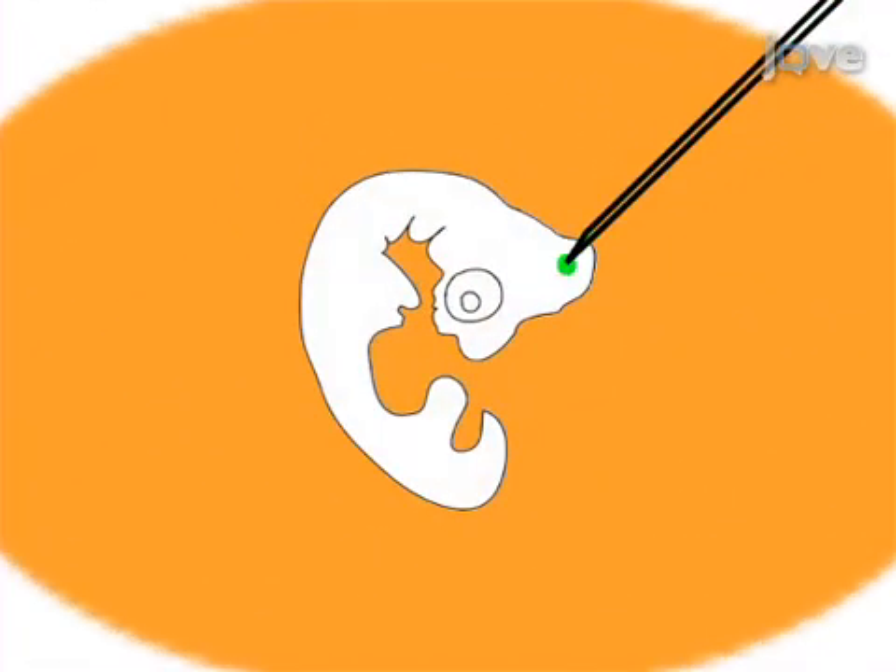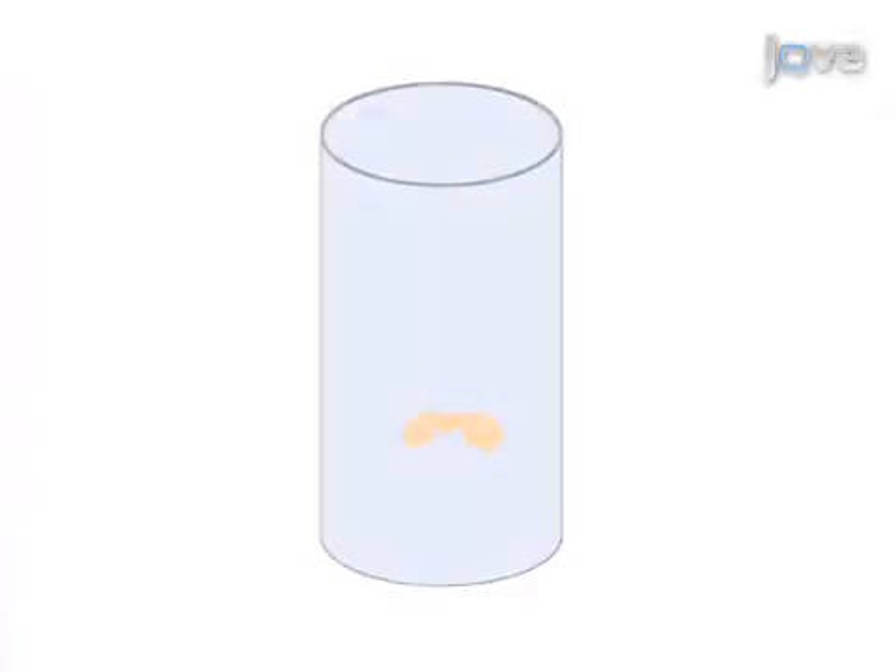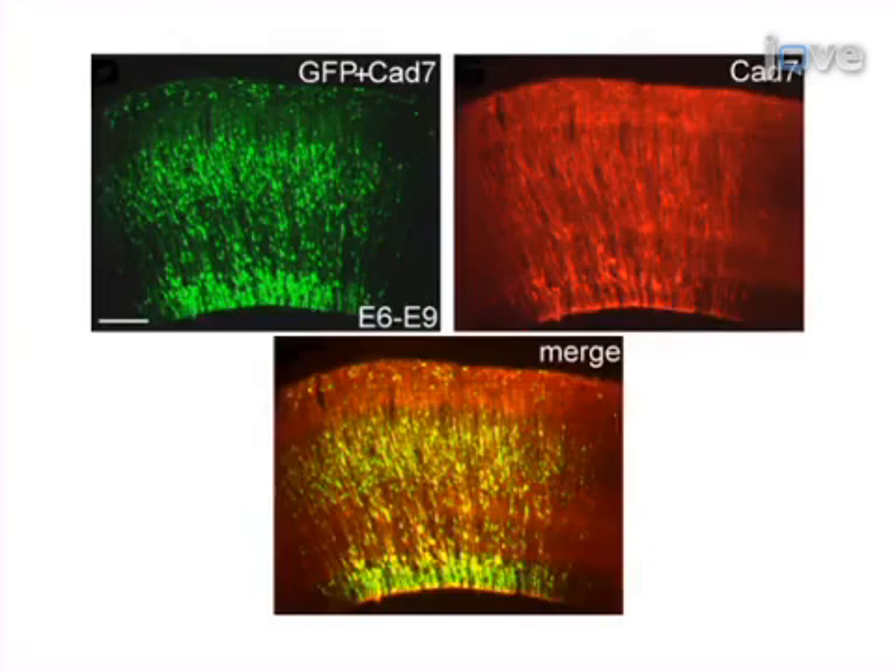After injecting the plasmid, place electrodes beside the embryo and perform ex ovo electroporation. The final step is to collect the electroporated embryos for analysis. Ultimately, immunohistochemistry is used to detect expression of transferred genes in the embryo. Today we will show you how to do the ex ovo electroporation using chicken embryos.